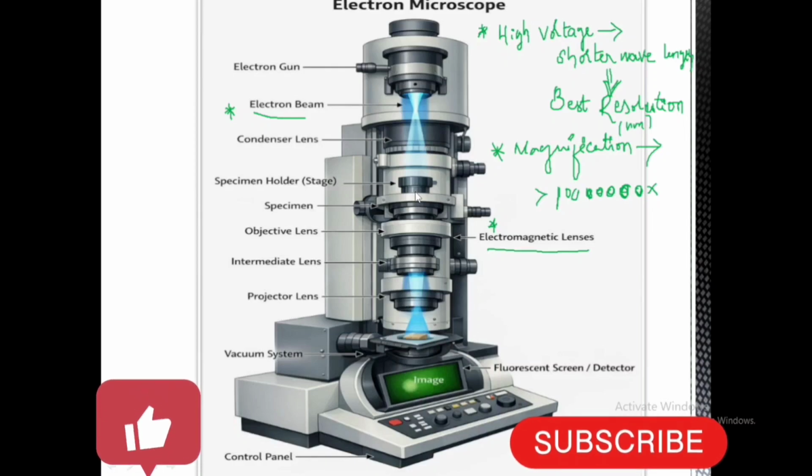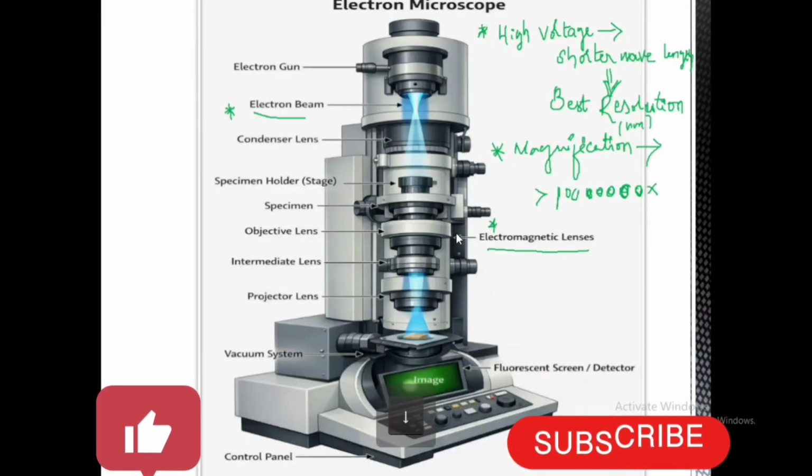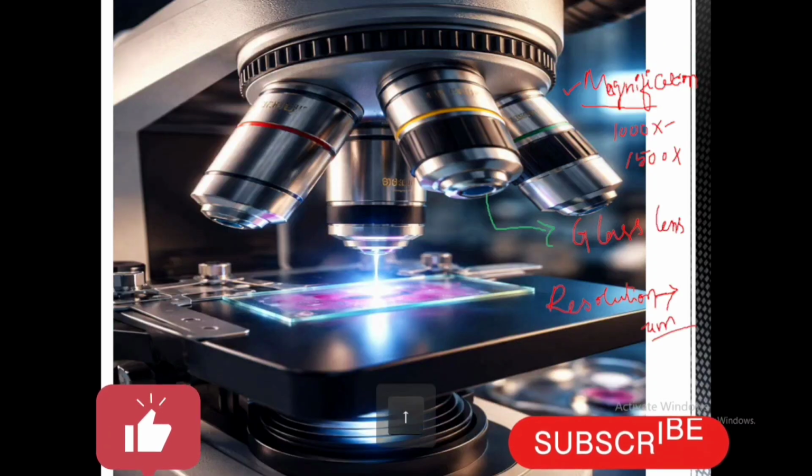Next, in the light microscope we can see live organisms. But in the electron microscope we can see dead organisms and dried organisms. These are the main differences between light microscopy and electron microscopy.